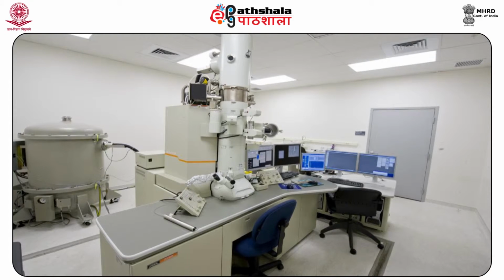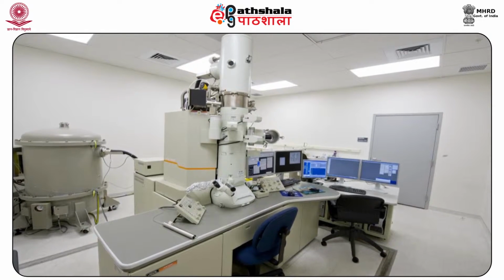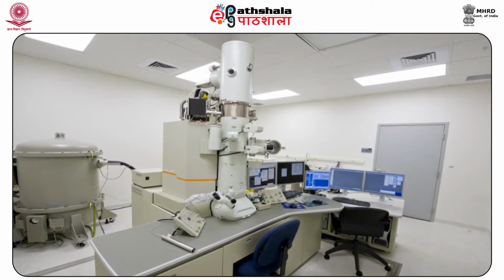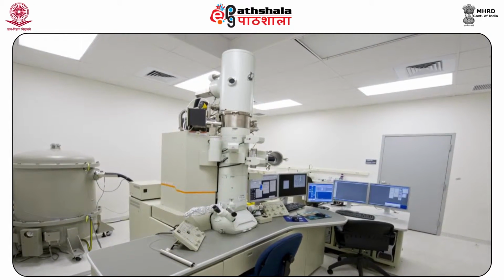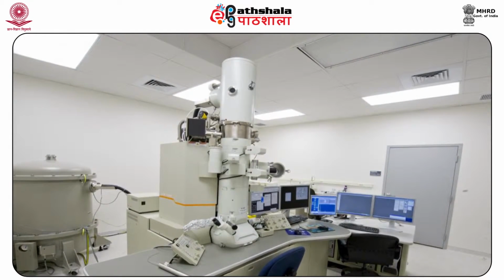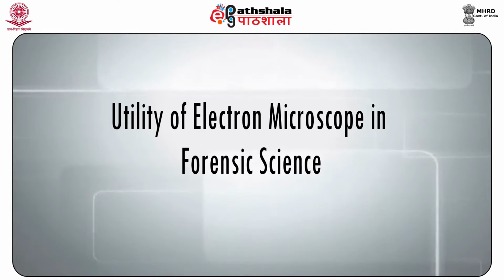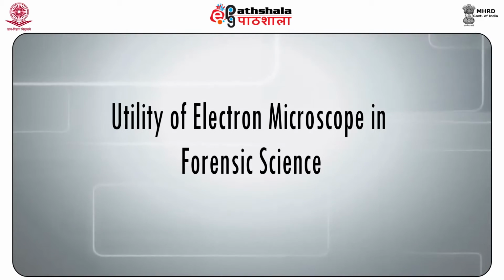In the TEM, an electron beam is passed through an extremely thin section of the specimen and a 2D cross section of the specimen is obtained. SEM, in contrast, visualizes the surface or structure of the specimen, providing a 3D impression. Now, let me shed light on the utility of electron microscope in forensic science.